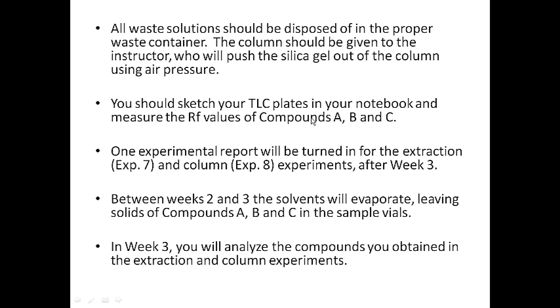At the end of the column experiment, you're going to place all of your waste solutions in the proper waste container, because they'll contain ethyl acetate and hexanes. The TLC jar will have contained ethyl acetate and acetic acid. You'll give the column to the instructor, or probably to me, and I will use gentle air pressure to push the silica gel back out of the column, and then it can be cleaned and reused for the next lab period.